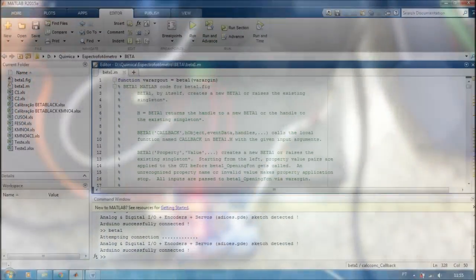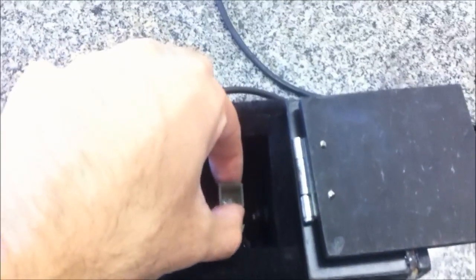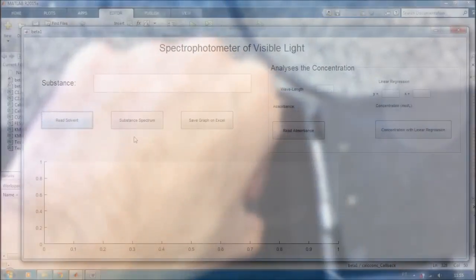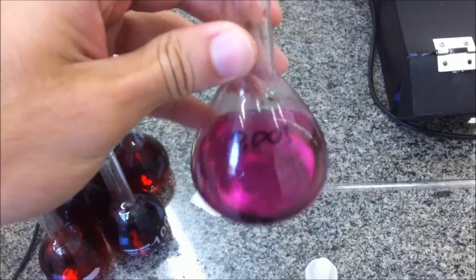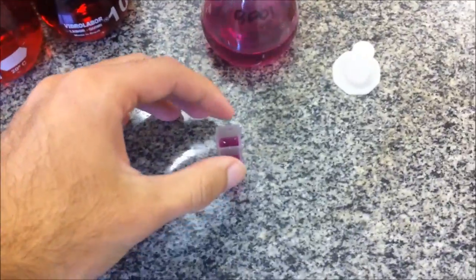In MATLAB, I programmed an interface that controls the Arduino. This interface helps the user to make the analysis of a graphic excluding solvent data and showing the electromagnetic spectrum absorbance of a given chemical substance.